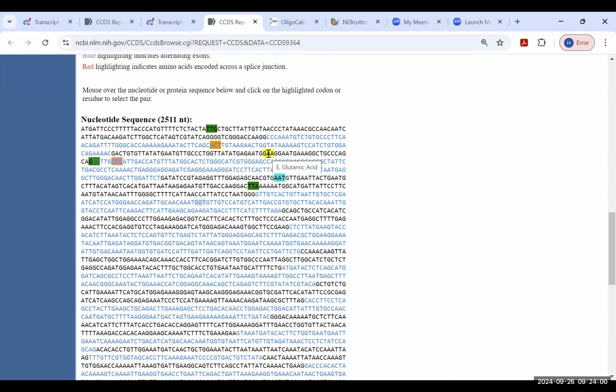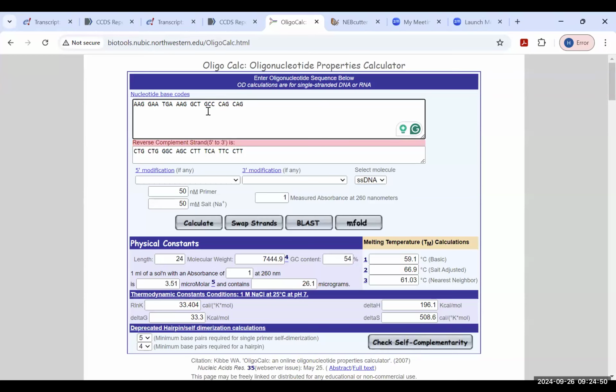And I will paste it and do a calculation. GC content is 56, which is between 50 and 60. It's still okay. But what I can do is, for example, remove this G and calculate again, and it's 54 now. If I remove the two A's, that doesn't help. If I remove the A and calculate, it will be higher. So it's better I keep the A.